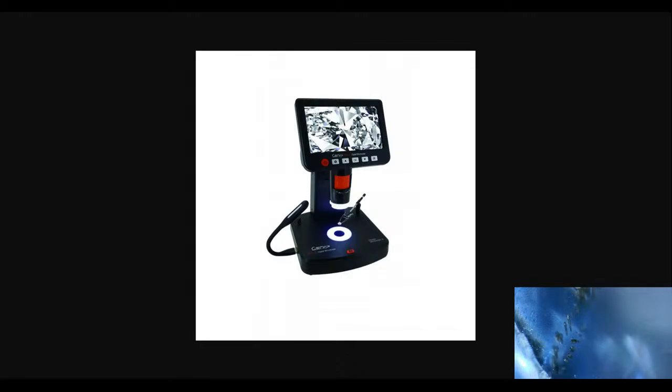I mean, you couldn't use like a tiny, how do you call it, a ruler, is it called a calibration ruler? You can use that, and then you can kind of use that as a measurement, but you would need another microscope. I basically checked my analog microscope and then compared it to the digital one. That's how I measured this. It's not scientific, but it's accurate in the sense that I know this is around 100, and then it goes to 400 maximum. I did that already.